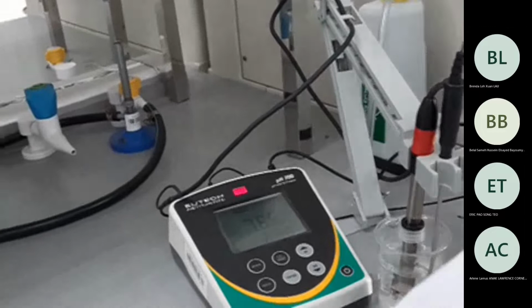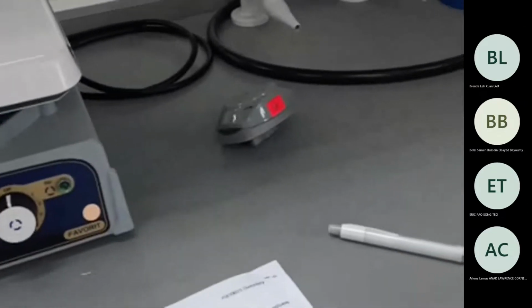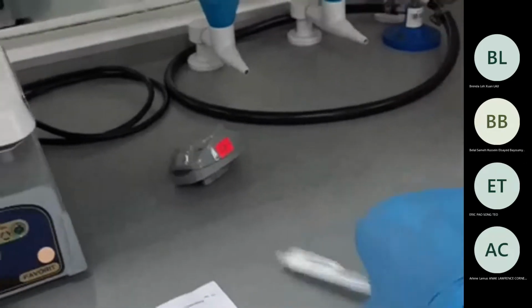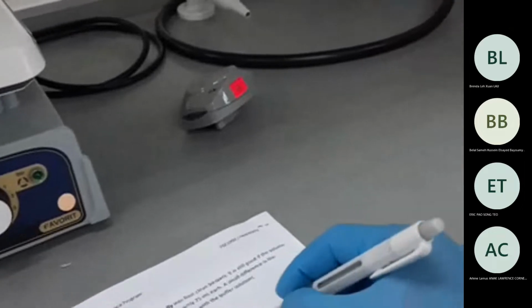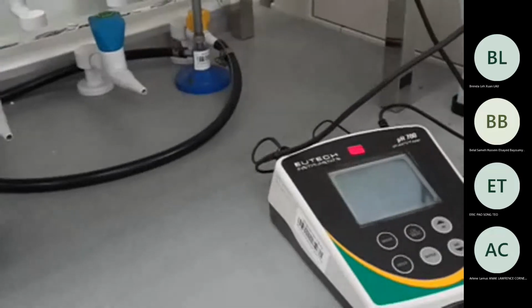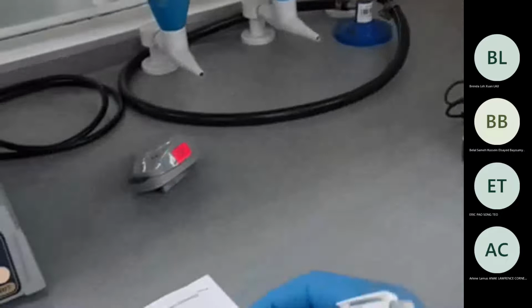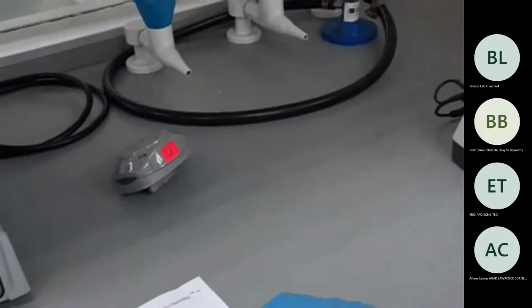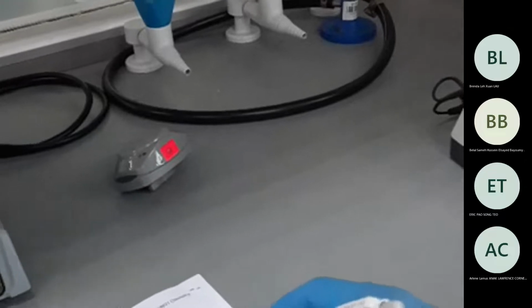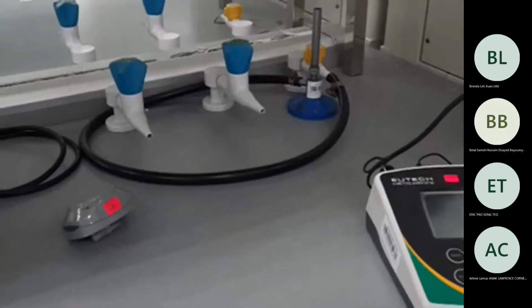So this one is ready, later we put it here. Deionized water, okay, we have taken. It's okay. We will just keep the tap water somewhere here. 7 point... for you, it's 7.7, let's say. And the temperature is 22 degrees centigrade in the lab today. Okay, it's enough. Just take it.